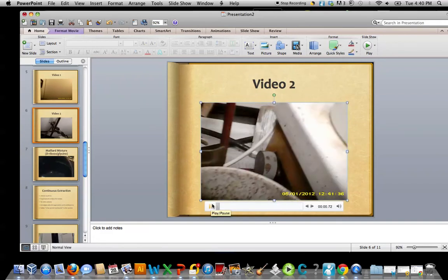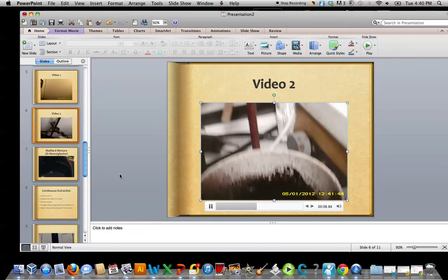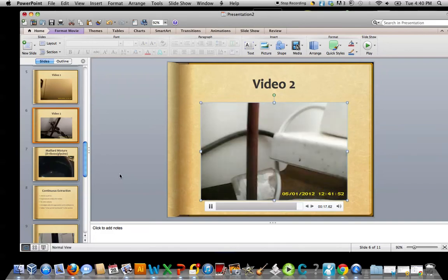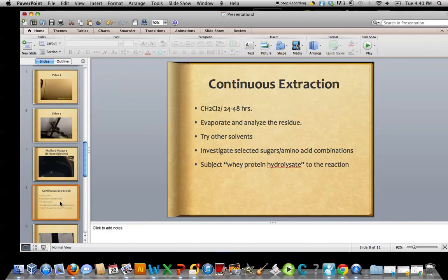Let's go to video two now — just a little bit closer look at this Maillard mixture. I left it with air passing over for a couple of hours to take a sample, then I took it back up in water. I carry out continuous extraction next. Typically, what I'll do is dissolve this Maillard mixture — it's readily soluble in water — and contact it with a polar solvent, dichloromethane, methylene chloride, a rather low boiler, basically immiscible with water. I'll heat that up in a continuous extractor for 24 to 48 hours. After that time, I'll evaporate the organic solvent and analyze the residue. It really makes things a little easier for characterization.